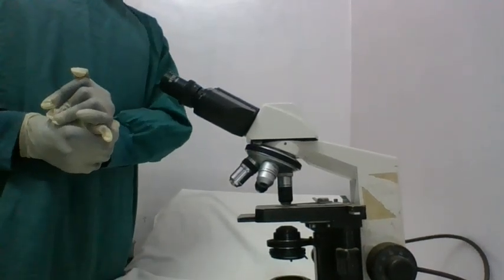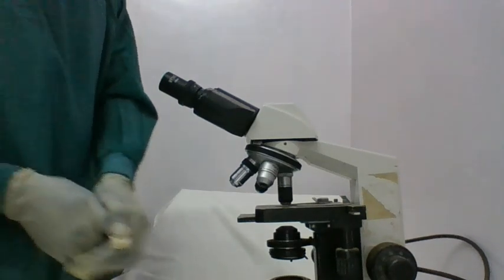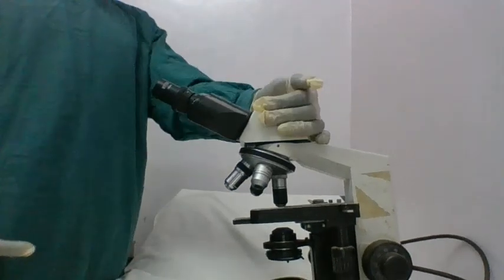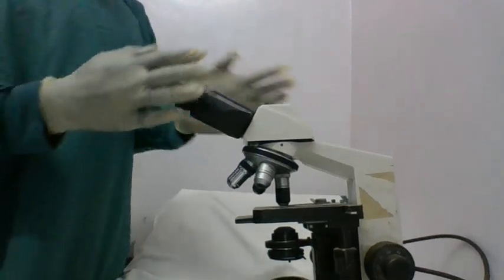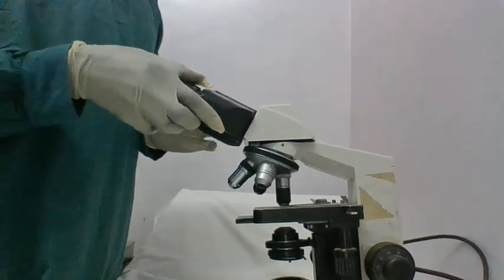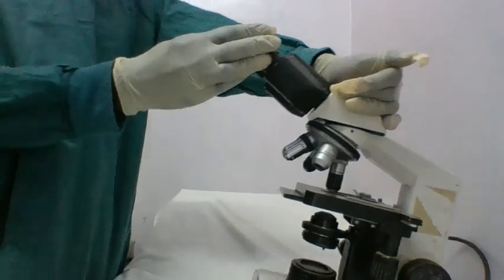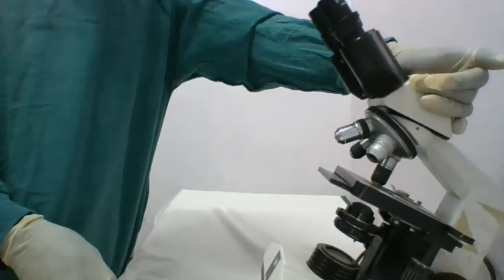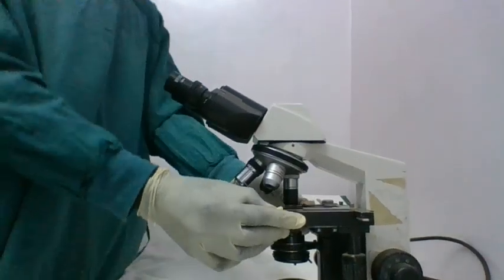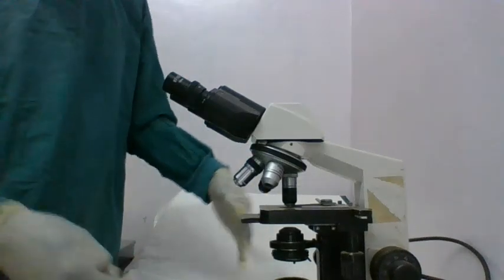So guys, we are going to look at the different parts of the microscope. I know you have learned it. Maybe you are medical lab personnel or maybe you are medical engineering personnel. Basically, you have been taught these instruments in your training, or it was studied in your units, guys. So here is our microscope, as you can see. I know we even learn it in high school, in biology, if I'm not wrong.